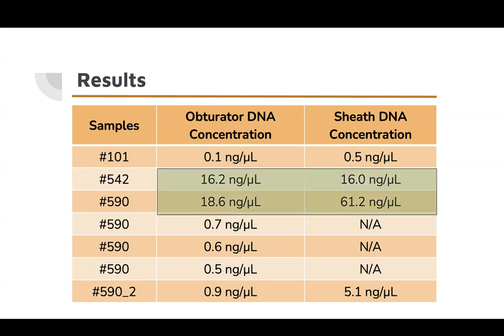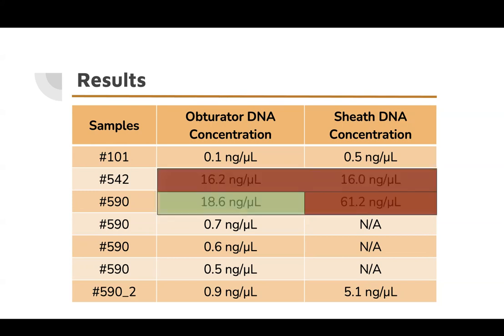However, 4 samples did meet this standard. But after performing the microsatellite panel, the results indicated that there were no markers in the 3 highlighted samples, and thus the DNA was just randomly put together and did not match human DNA. Unfortunately, the final remaining sample failed as well, as the microsatellite panel indicated contamination.